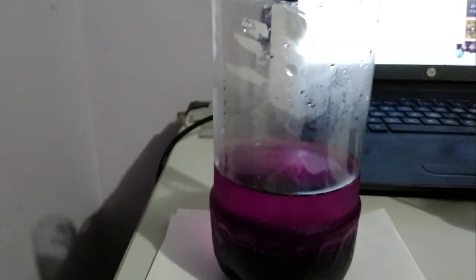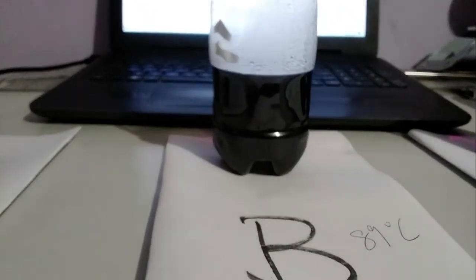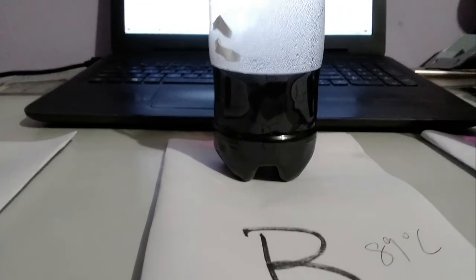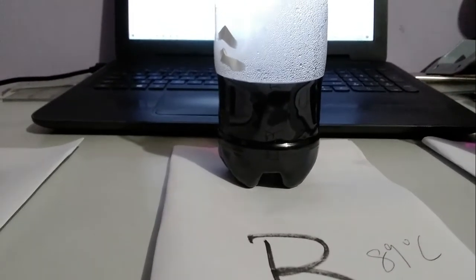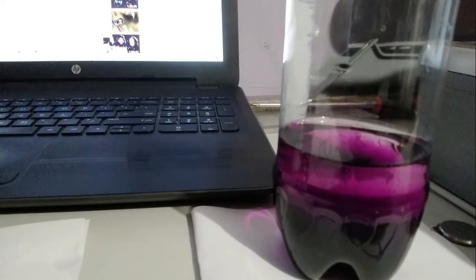We're still looking at the water column. We're 7 minutes into the experiment, and of course you would have seen the 89 degrees Celsius. That water is pretty purple, like probably you would want to see a grape soda. Unlike the others, they look like they haven't been given much potassium permanganate. But of course, remember, we are looking at how temperature impacts the rate of diffusion.